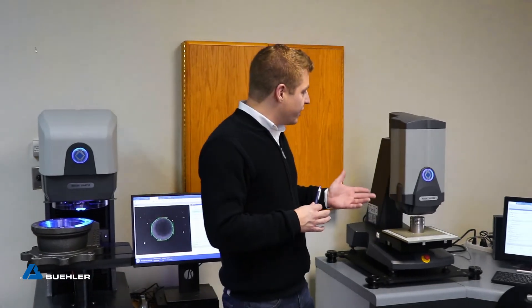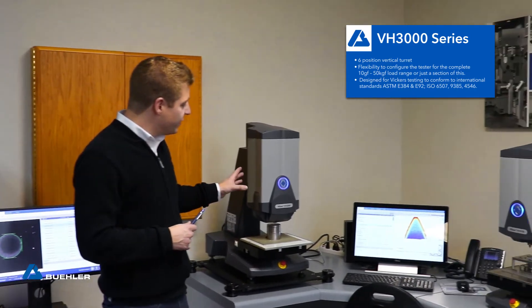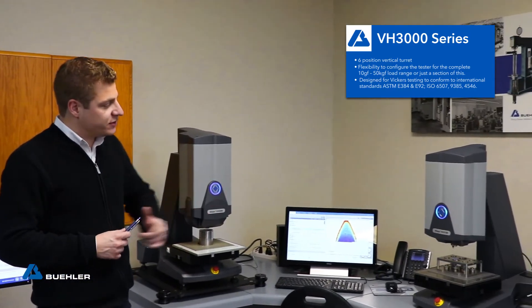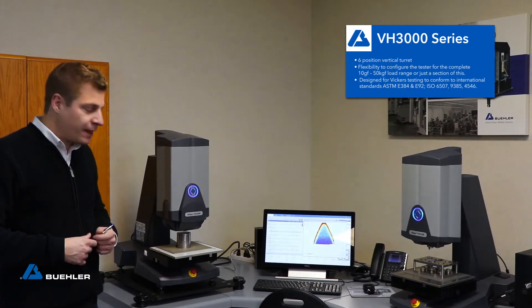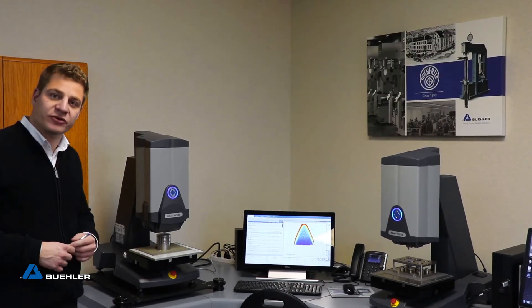On the other side we have our Vickers full automatic hardness testers, the VH-3300 as well as the VH-3100, and both instruments are controlled with our Diamond hardness testing software.